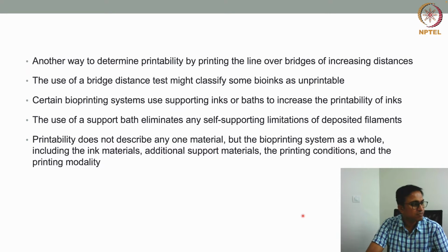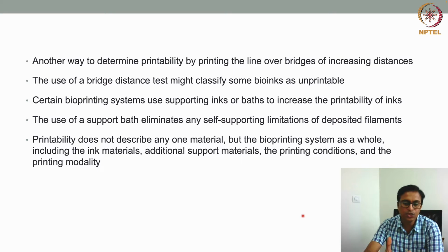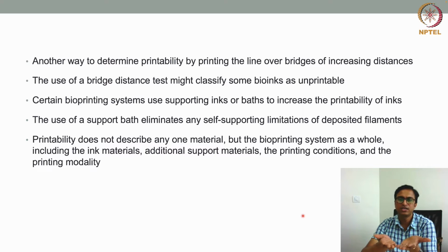In certain bioprinting systems we have discussed earlier, one such thing is 3D printing in a support bath. There they use a support bath as a support material to hold the bioink during printing.